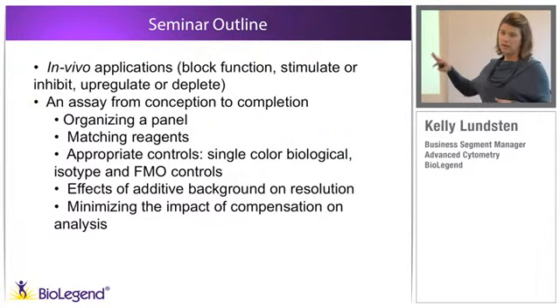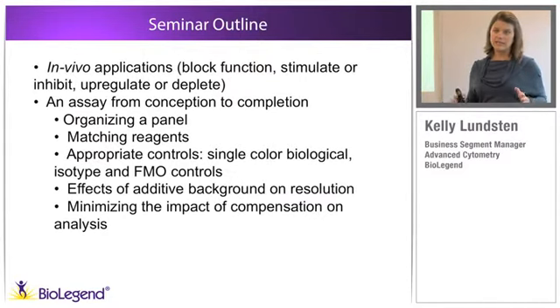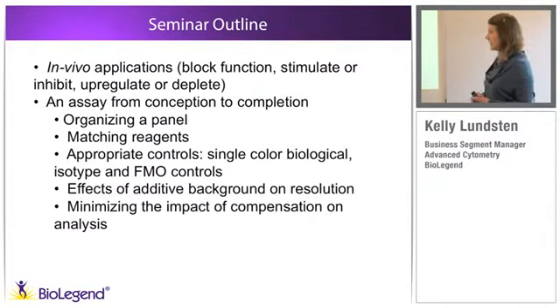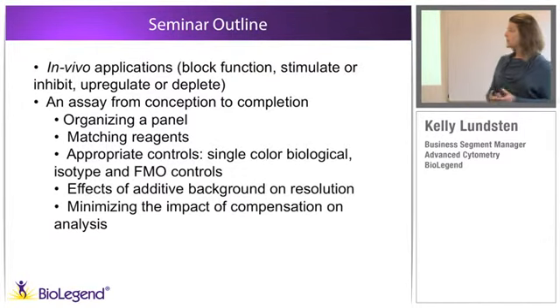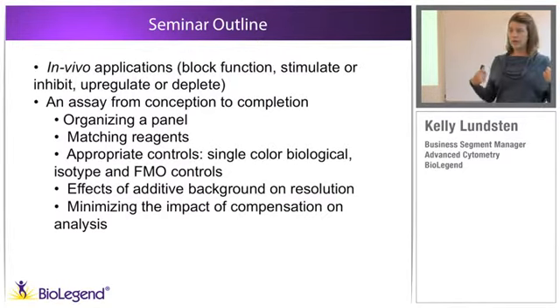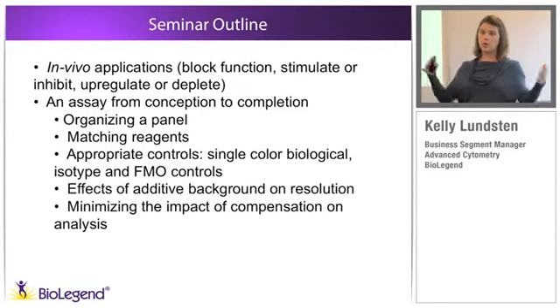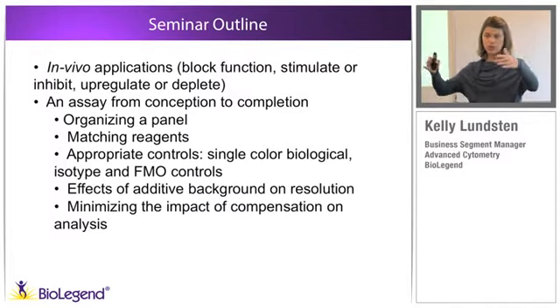So we're going to talk about the process to make sure that when you get to that point, you have the cleanest set of data possible to make your analysis internally consistent, reproducible, and clear and easy. We're going to discuss all the appropriate controls involved in that process. So not only using single color biological controls in order to appropriately assess the voltage range of each PMT, to make sure that no matter what small changes happen with expression, you can keep the same voltages for the course of the majority of your experiment.